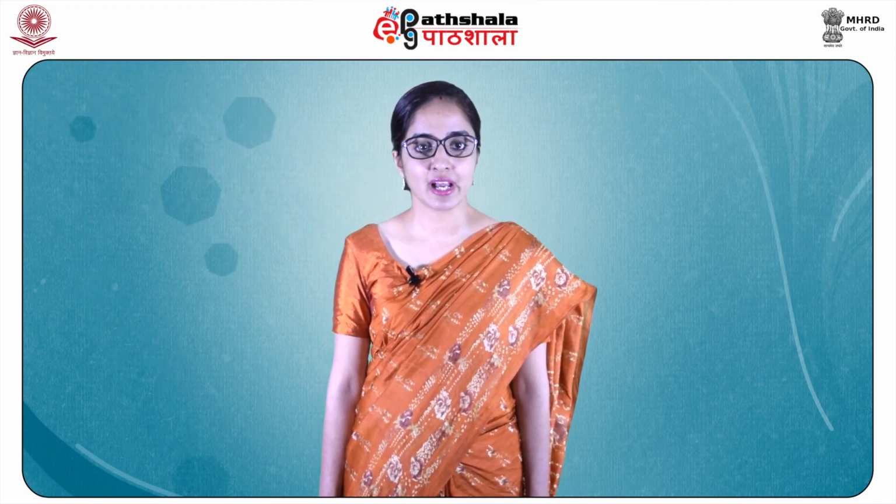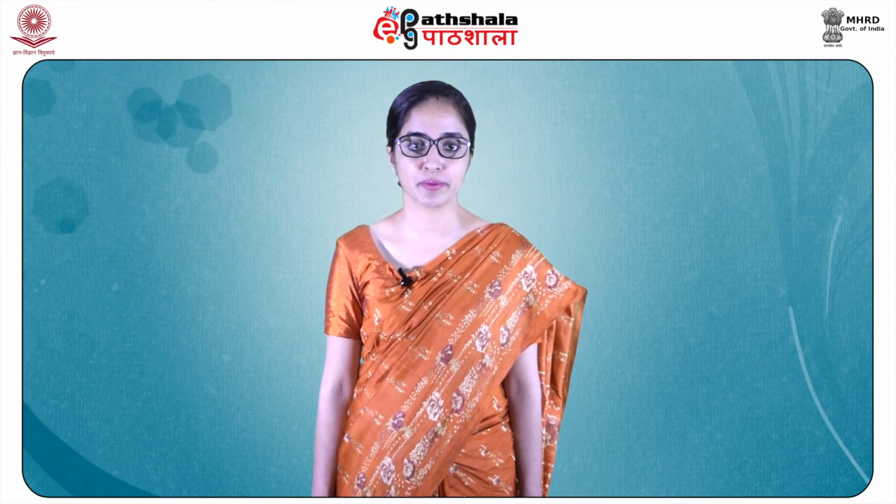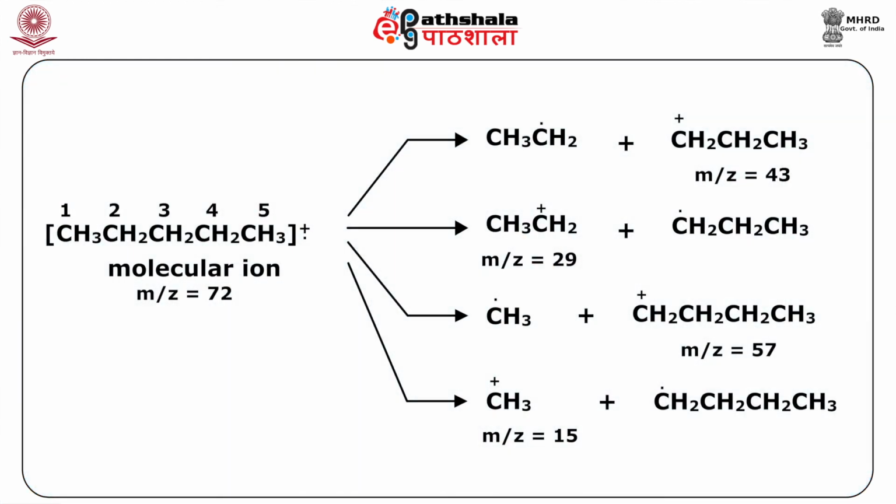The m by z value is the nominal molecular mass of the fragment, and it is the molecular mass to the nearest whole number. For example, students, pentane has a molecular mass of 72.0939 AMU and a nominal molecular mass of 72 AMU, that is, we round off this figure.